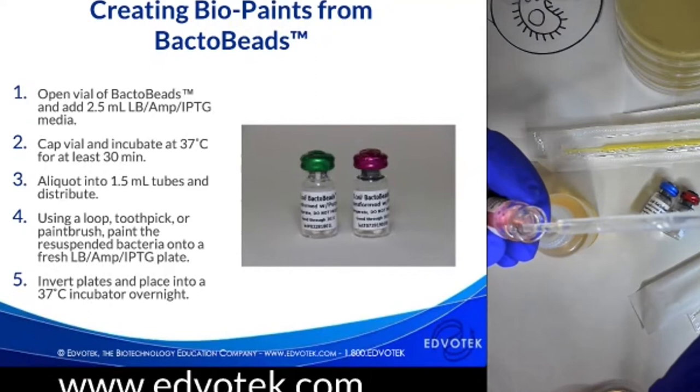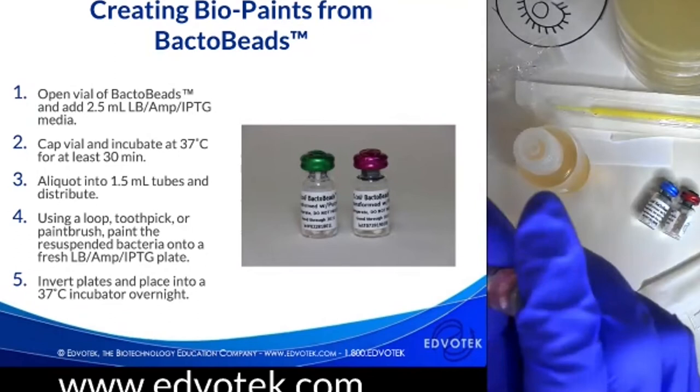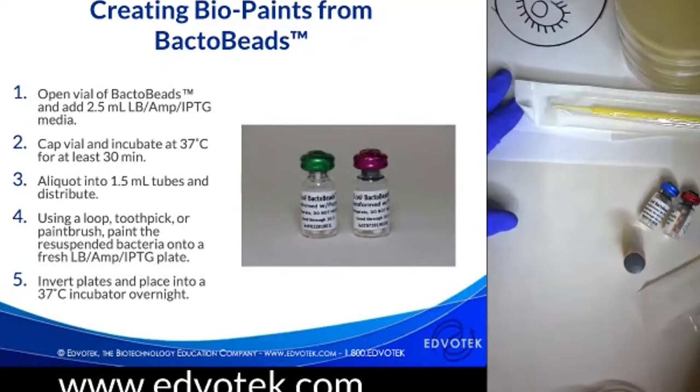I like to incubate them for 30 minutes to give the bacteria a chance to get healthy again after being lyophilized. You can see they're even pink here, because they were expressing a bit of the protein before they were lyophilized in the first place. So basically you would incubate this for 30 minutes and then start your painting. And I'm going to do a little demonstration here.